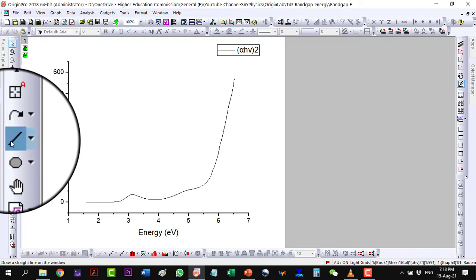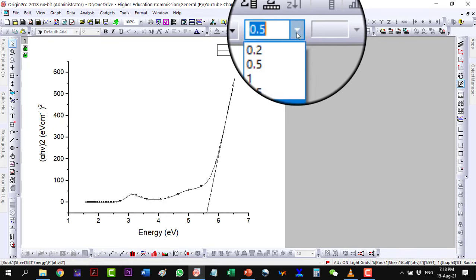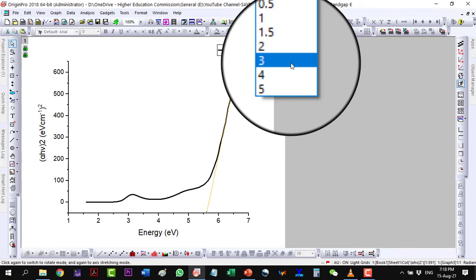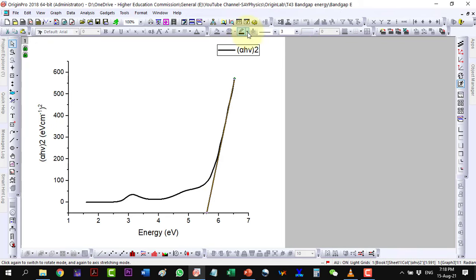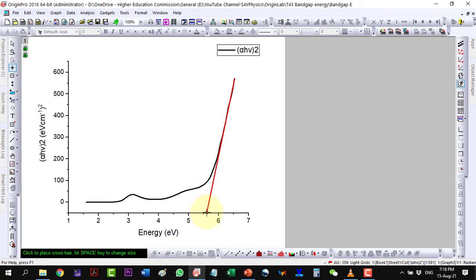With the line tool, draw a straight line on the X axis. Now, with the screen reader, we can find the X intercept value.